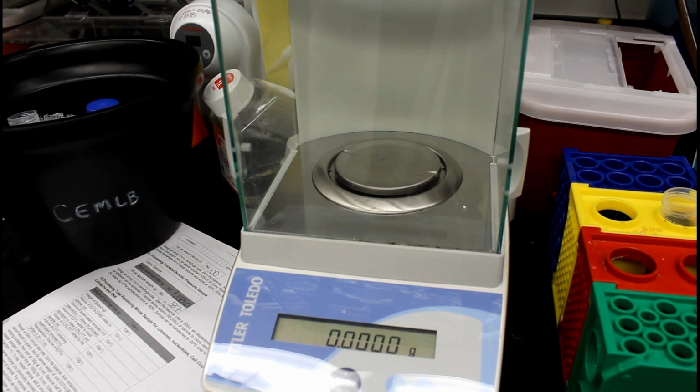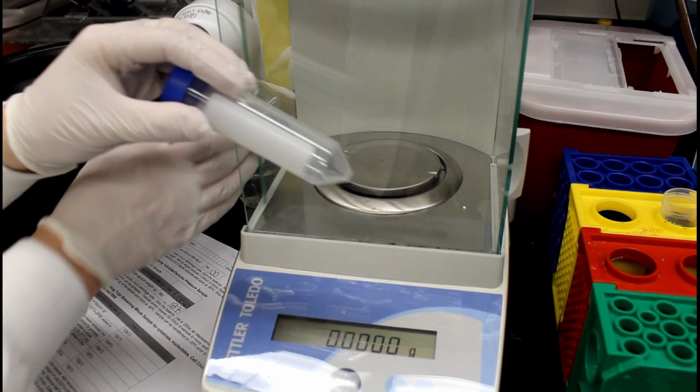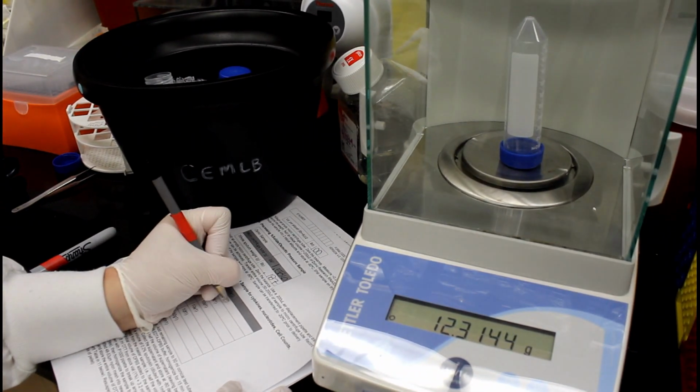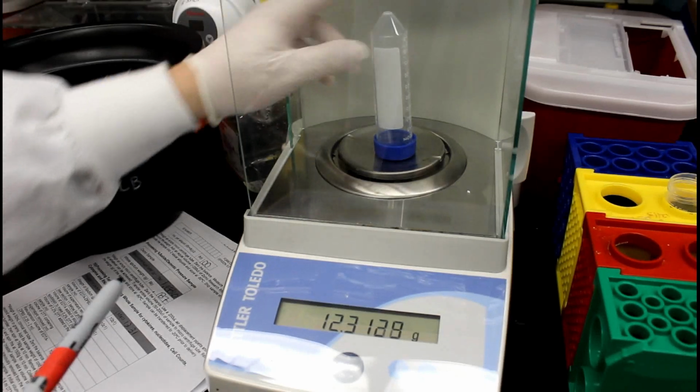The next step is to process the remaining sample for cytokines, nucleotides, cell counts, cytospins, and RNA. First, weigh an empty 50 ml conical test tube. Next, zero the balance.